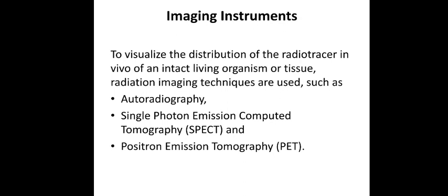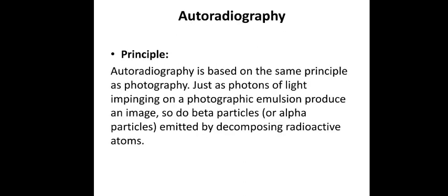So here, depending on the decay techniques, alpha decay, beta decay or gamma decay or positron decay, or even photon emission, any one of these will be used. But the most commonly used technique, which you might even be learning in your next coming sessions, is autoradiography. As the name itself says, it is autoradiography. Auto, self, graphy, a graph, a picture, and radio.